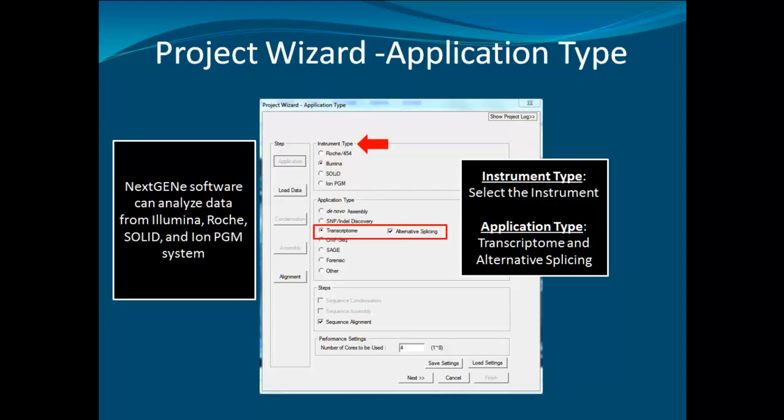To begin the analysis, in the Project Wizard Application Type window, select the instrument type and transcriptome analysis under Application Type, along with alternative splicing. If alternative splicing is not selected, a normal unspliced algorithm will be performed and transcripts will not be called. Expression analysis can still be performed, but reads will not be aligned across junction regions. Once everything is selected, click Next.